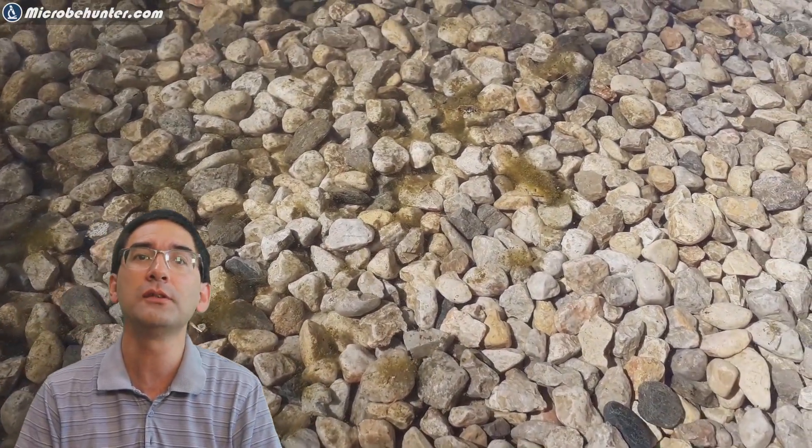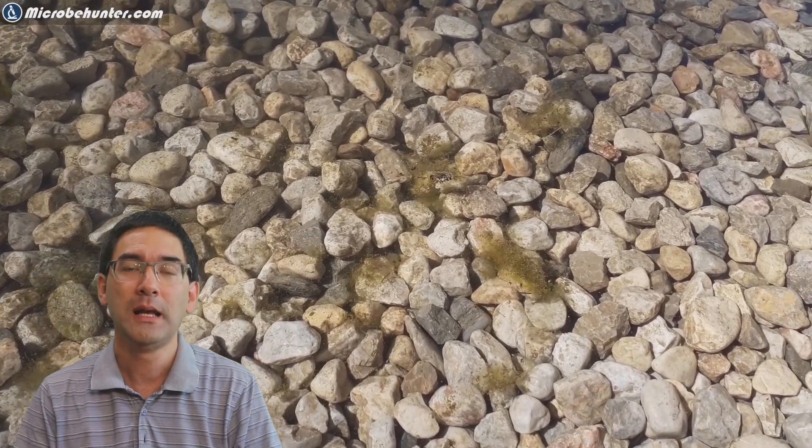As a matter of fact it's not surprising to find if you have stagnant water, it's not surprising to find those spirogyra algae and they can be found essentially clustered together.